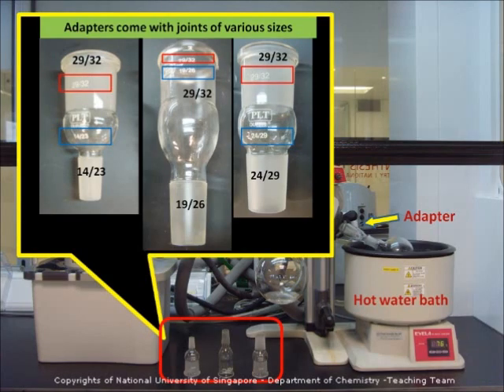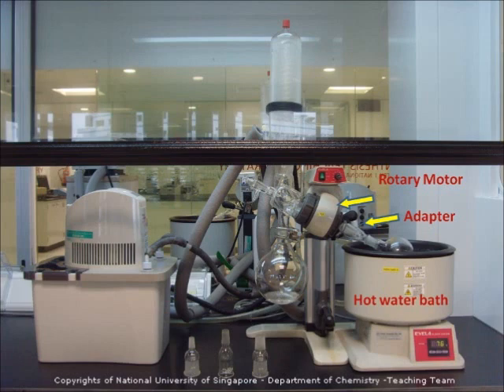The adapter comes with joints of various sizes. Here we are using the 19/26 neck. The rotary motor rotates the round bottom flask so that we can dry the solvents at a higher surface area.